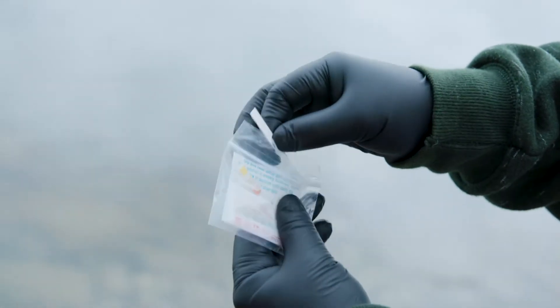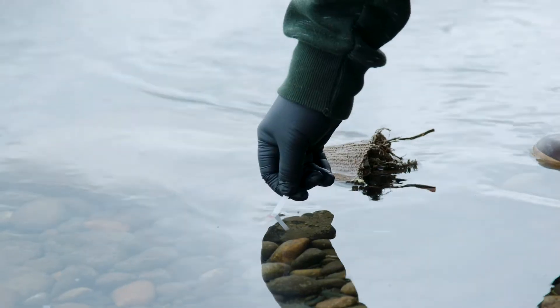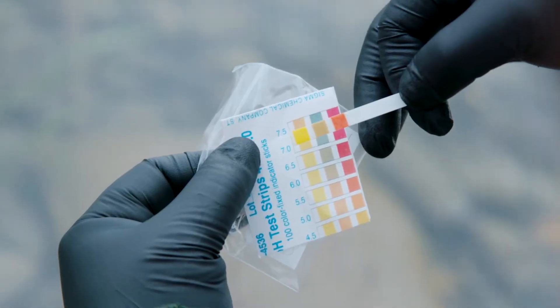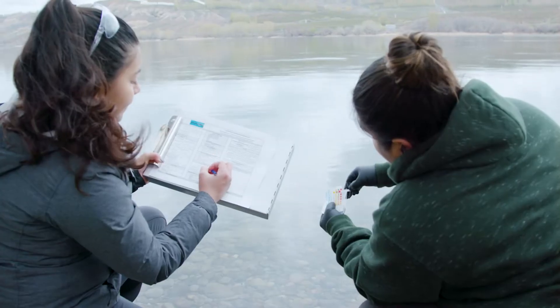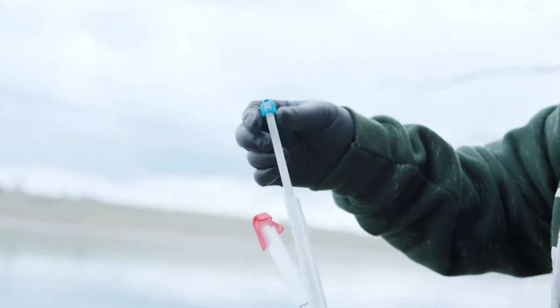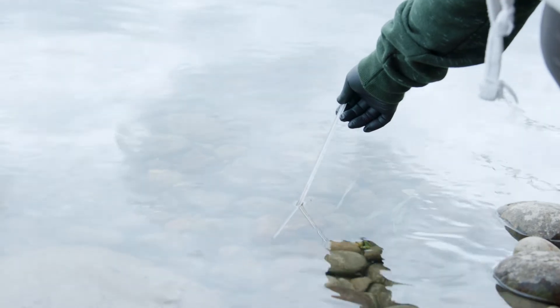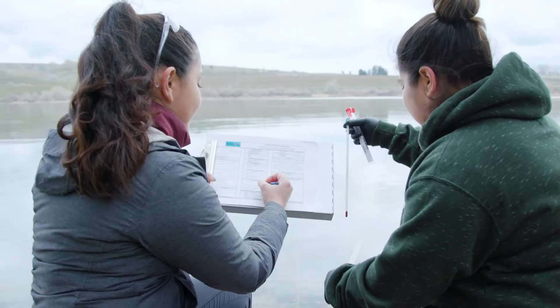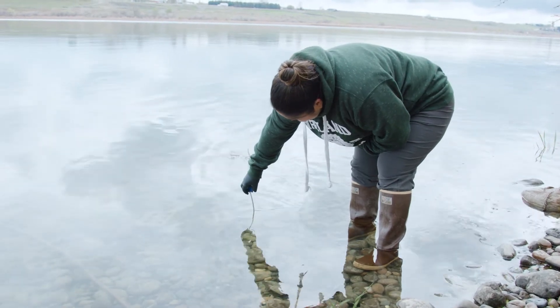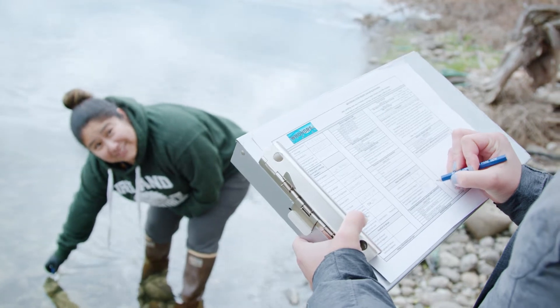Next, measure the pH of the river water with the provided strip by dipping it into the water upstream of where you are standing. After 15 seconds, compare the color of the strip to the color chart provided and record the pH value on the metadata sheet. Measure the temperature of the water at 50% of the water column depth near where you plan to sample and record it on the metadata sheet. Measure the water depth near where you plan to sample and record it on the metadata sheet. You are now ready to begin collecting samples.